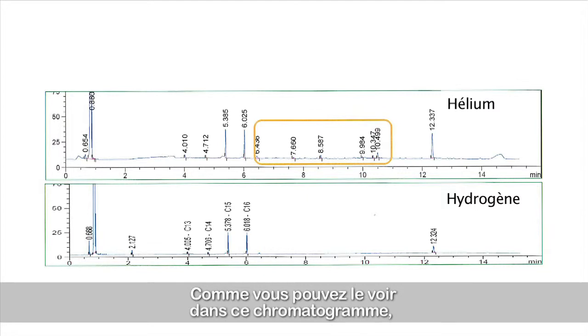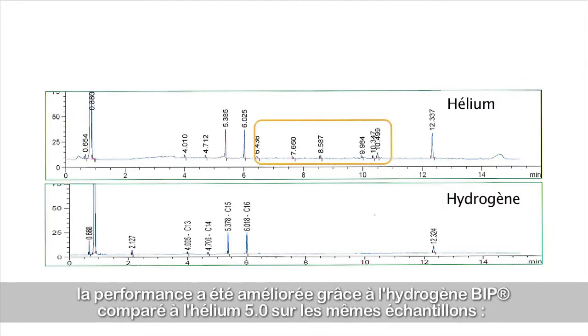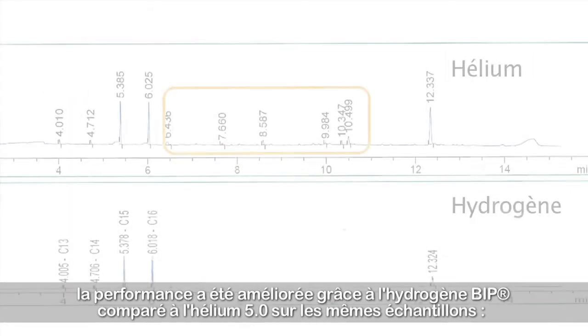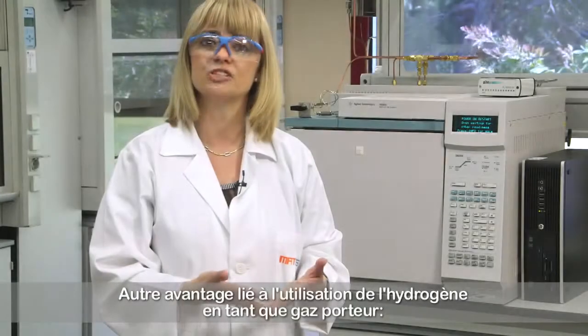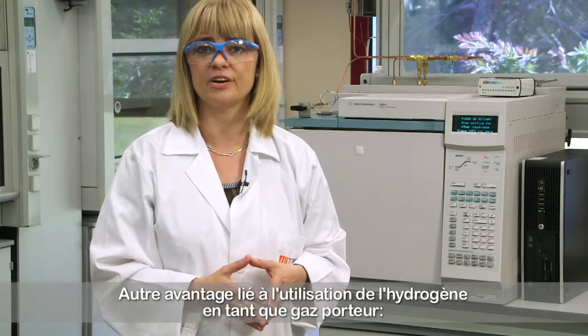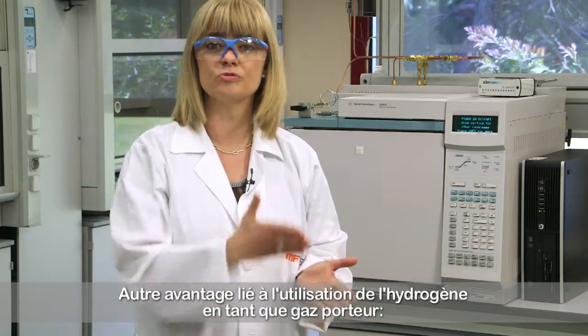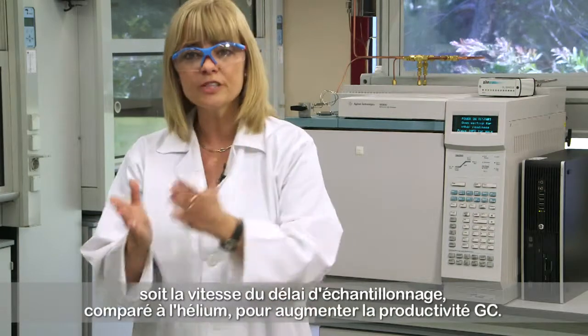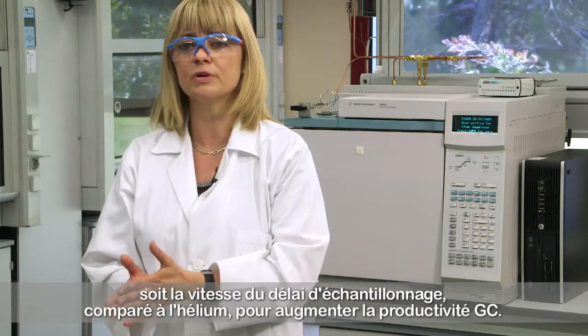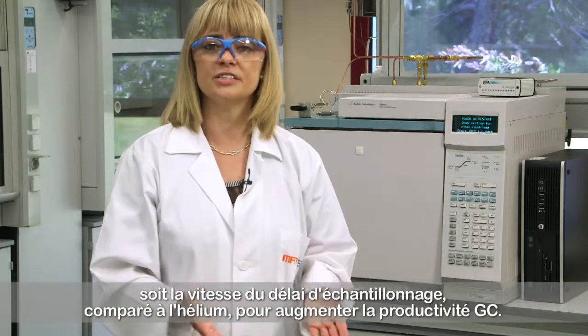As you can see in this chromatogram, better performance is obtained with hydrogen compared to helium for the same samples. The baseline is more stable and accurate. One additional advantage of working with hydrogen as a carrier gas is the possibility to choose between improving the resolution of the analytical procedure or the speed of the sampling time compared to helium, to increase the GC productivity.